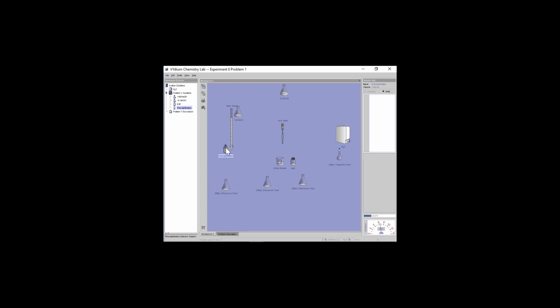So let's just take this phenolphthalein here. Let's go to my 3 containers. Let's transfer maybe 3 mils. So a couple drops. Doesn't matter exactly. I just need it present in each of the containers. A very common problem in titration is people forget the indicator. They start tossing in their base and they're like, hey, how come it's not changing to pink? Well, if you don't have the indicator, it's not going to change to pink. So there you go. Looks like I'm set up. So I have my 3 indicator solutions inside, and now I'm ready to do my titration.